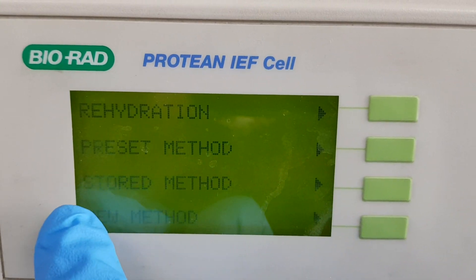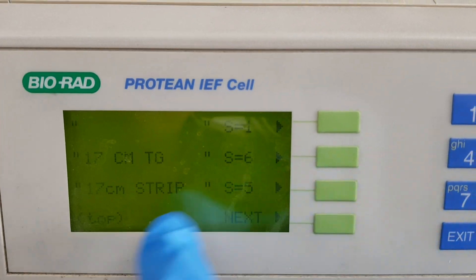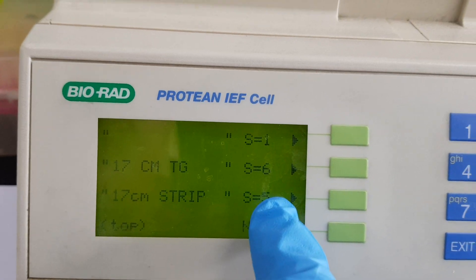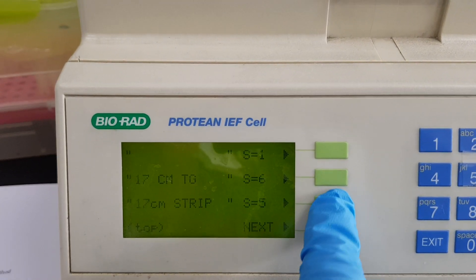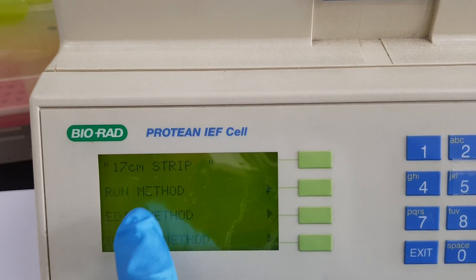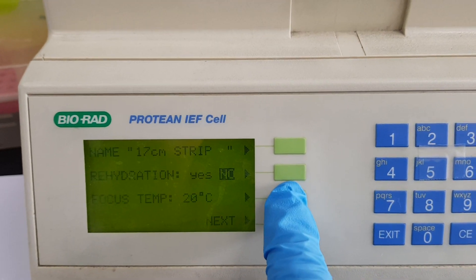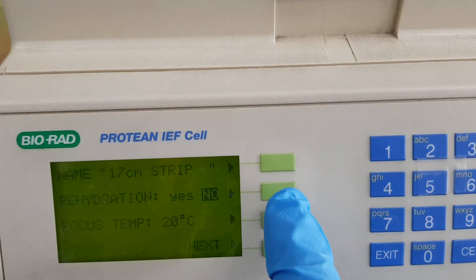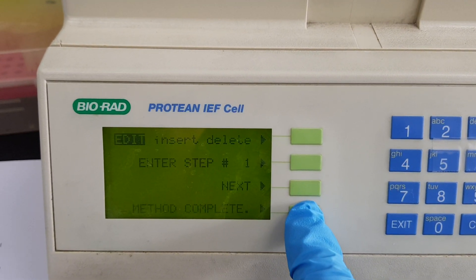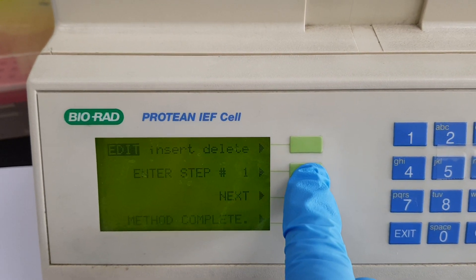We have finished the rehydration and now we will go for the store method — we will edit the store method. In our case we are using seven centimeter strips and we have five steps here, so we will select five steps and go to the edit method. We have already done the rehydration so we will move to the next part, where you can select the number of steps.